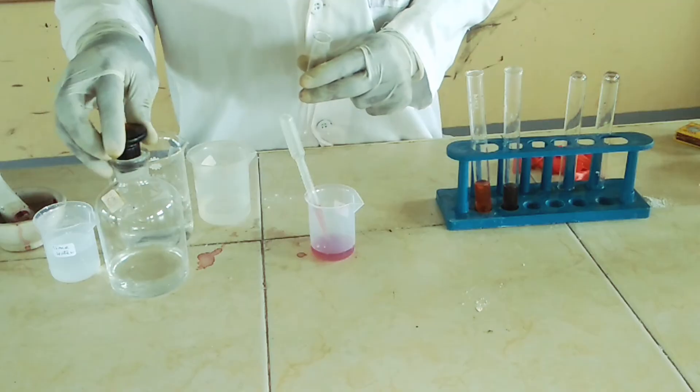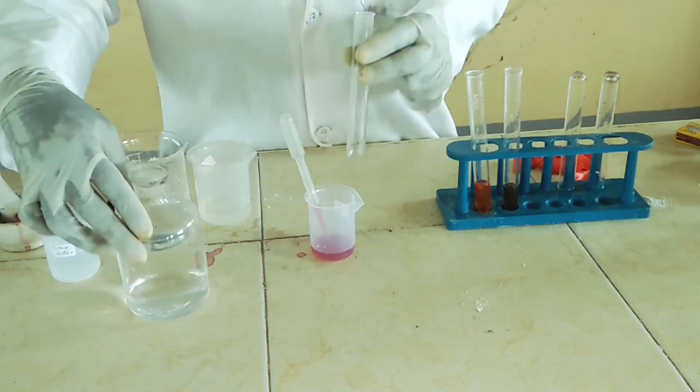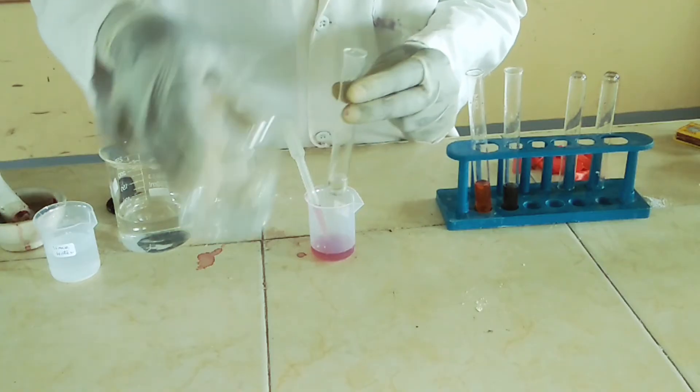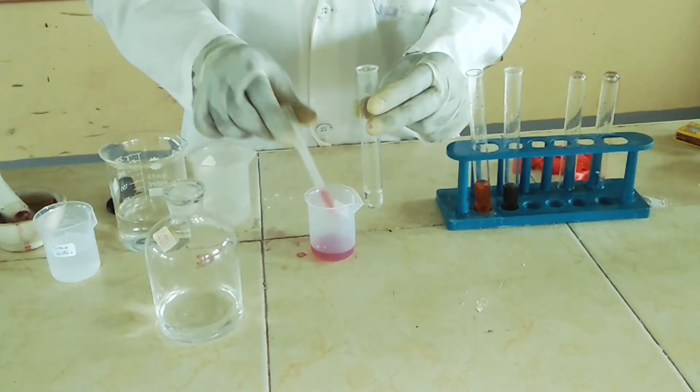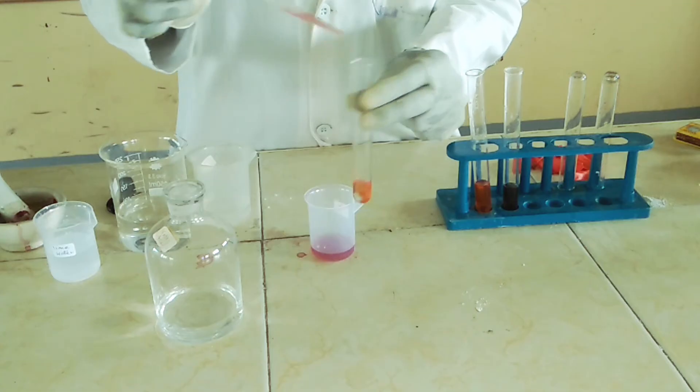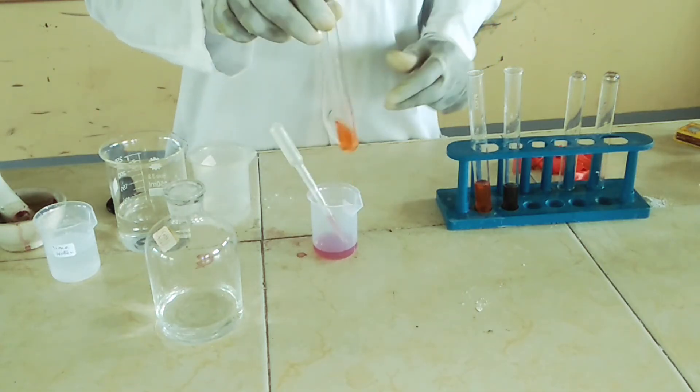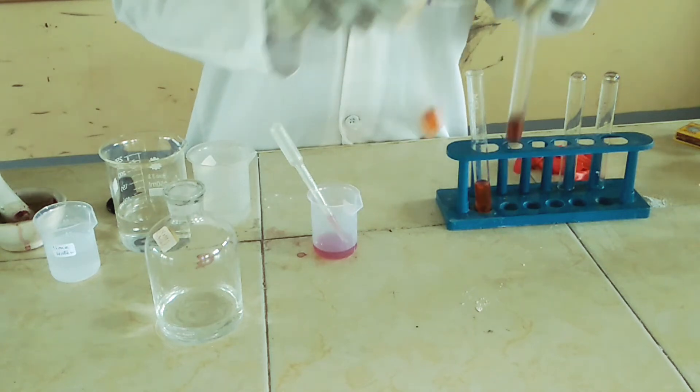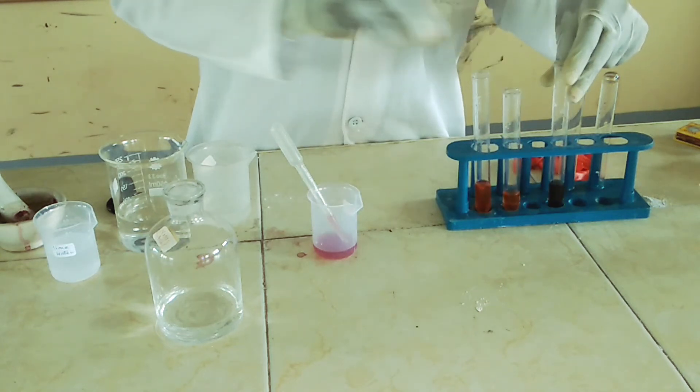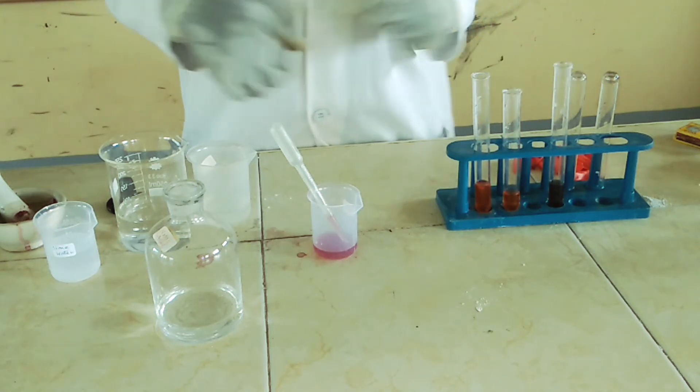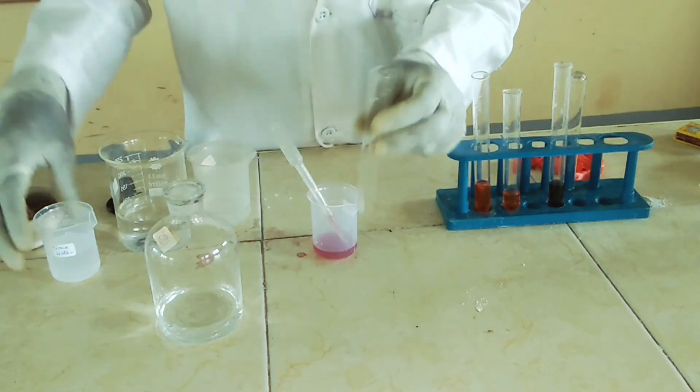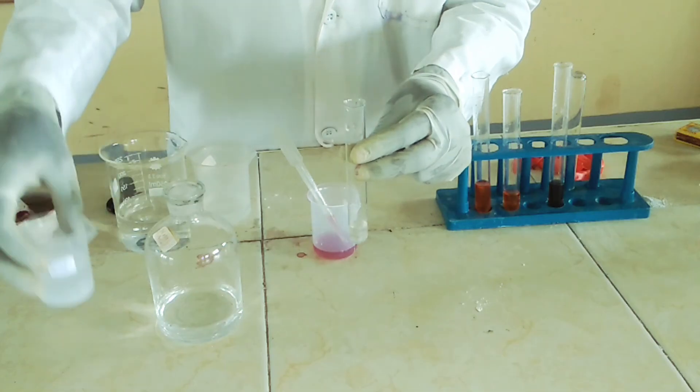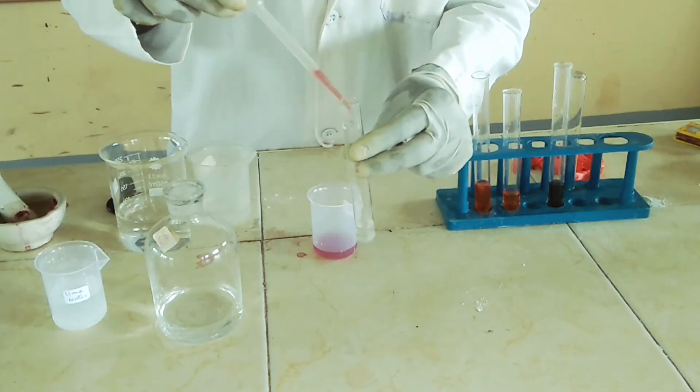I'm also going to test another acid using the same indicator. So I'm going to test nitric acid. Again, put some small amount of the nitric acid in a test tube, then add two to three drops and shake. Again, we are getting an orange color. You can see it's almost the color that we got using hydrochloric acid. So it's giving us a definite color in an acid.